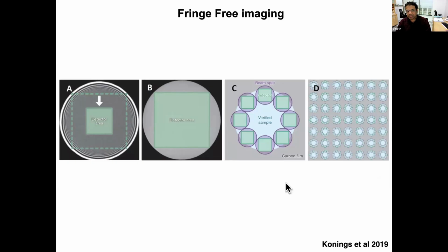Now, in the images I showed where there was charging, you didn't see the fringes. These come from the FEG because it's very coherent, and from the condenser aperture. You see these fringes. If you are condensing the beam and trying to take images like this, then because we are doing single particle, these fringes will come and affect the area.